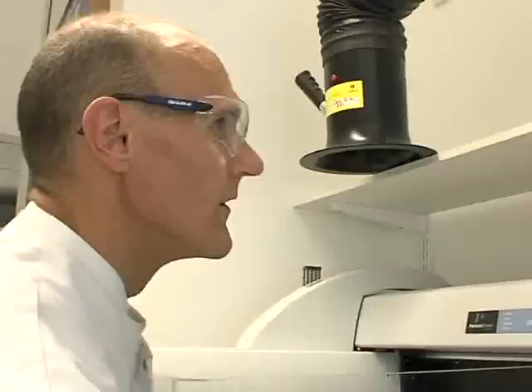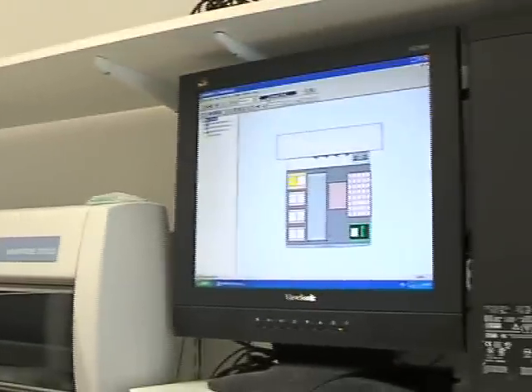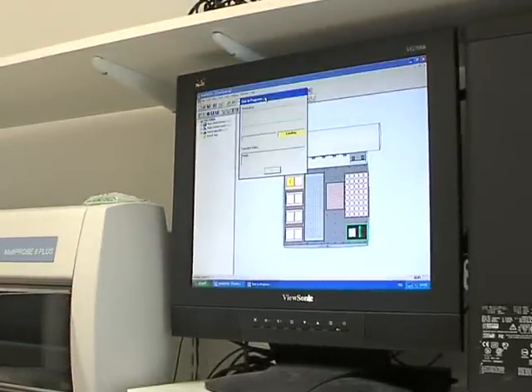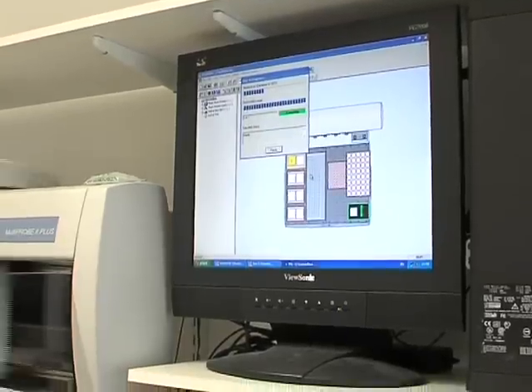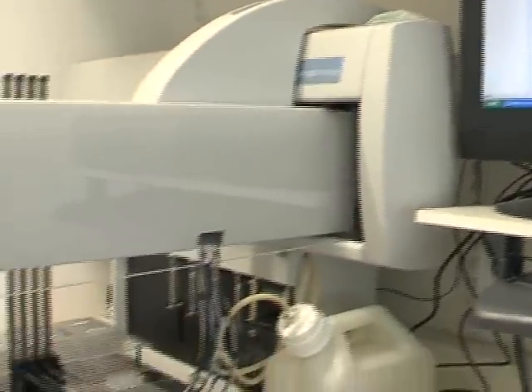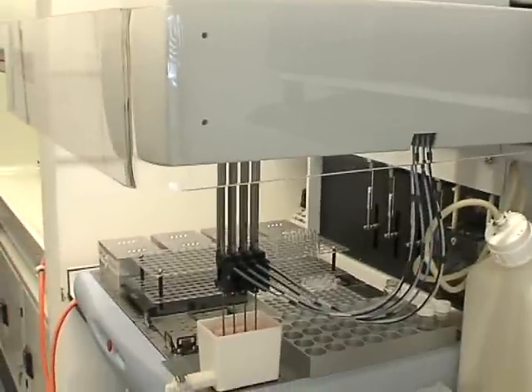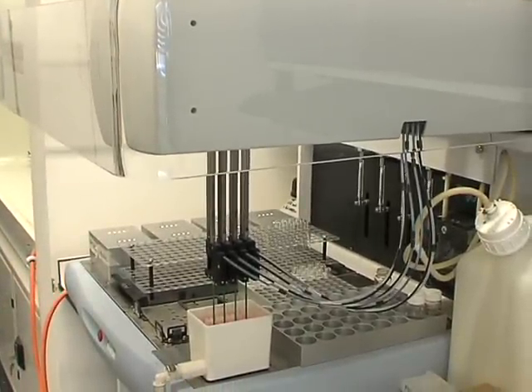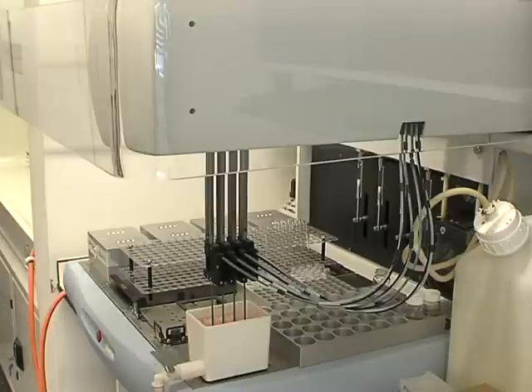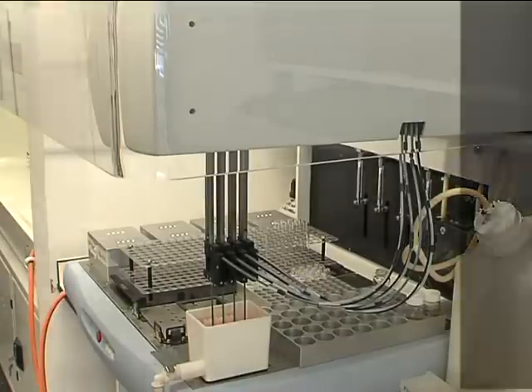The solvent selection part has been fully automated using a liquid handling robot and HPLC or GC, allowing the selection process to be operated automatically without anyone being present. Appropriate phase systems are selected by screening a graded range of solvent systems to identify one with a suitable distribution ratio for the compound of interest.